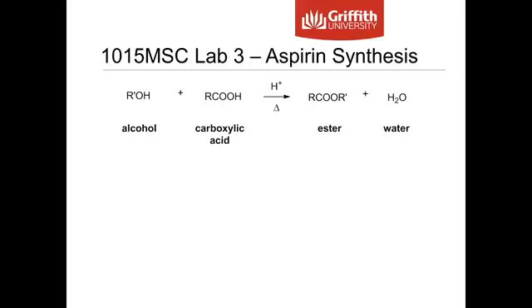In our third lab, we're going to be making aspirin. One of the important reactions we're going to look at this semester is the reaction between an alcohol plus a carboxylic acid. They will react together to form an ester, and the other product is water. This can be done under acidic conditions and with some heat.